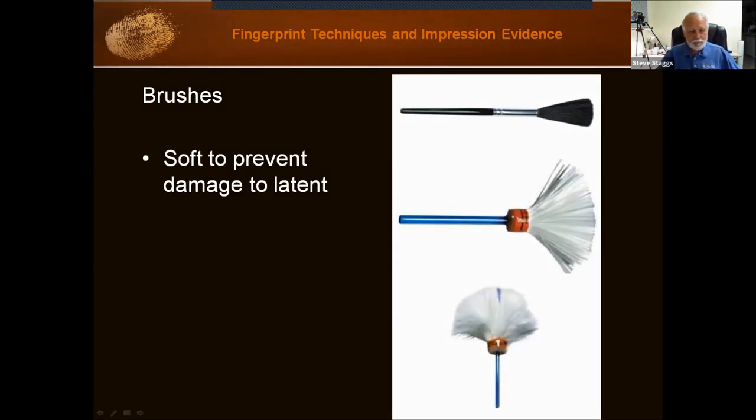Then there are the brushes — they come in different types as well. The top one is the camel hair or rabbit hair brush. The center one is the fiberglass filament brush, and the bottom one is a feather duster. The feather duster we normally use with fluorescent powders. The fiberglass filament brush is the best — they are very soft, hold the powder very well, and distribute it well.